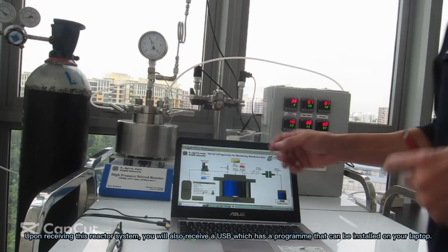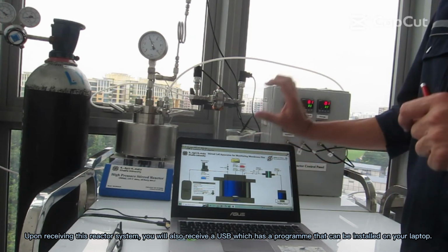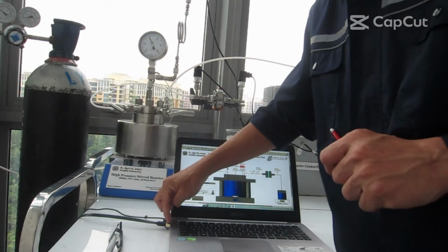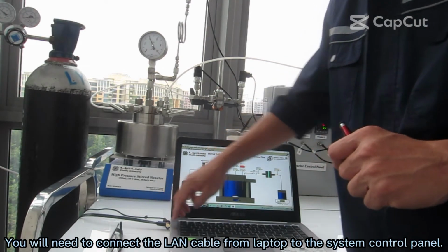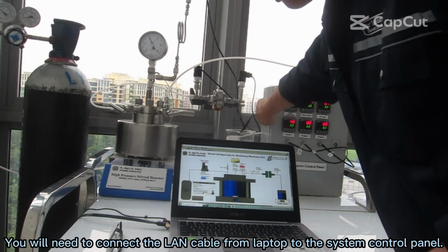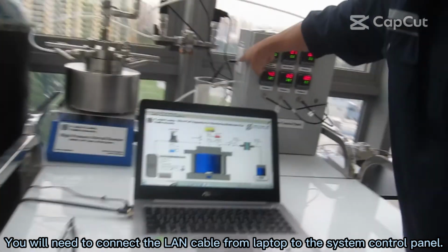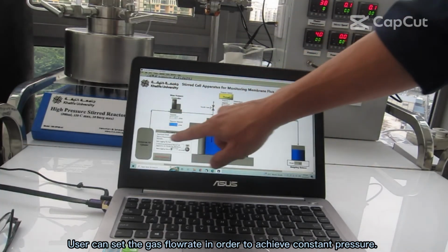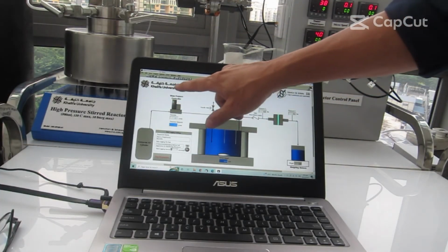Upon receiving this reactor system, you will also receive a USB which has a program that can be installed on your laptop. You will need to connect the LAN cable from the laptop to the system control panel. User can set the gas flow rate in order to achieve constant pressure.